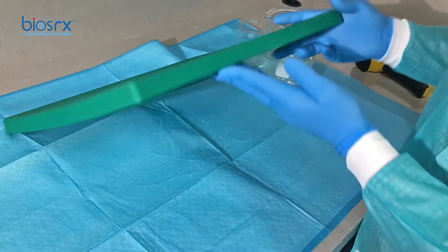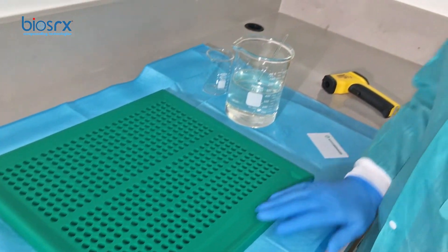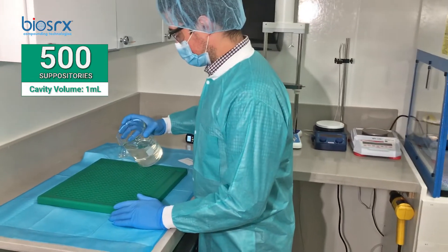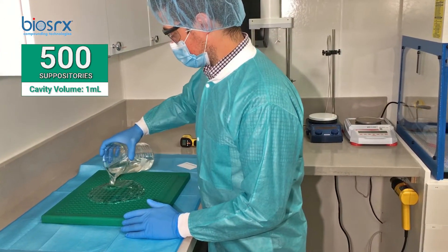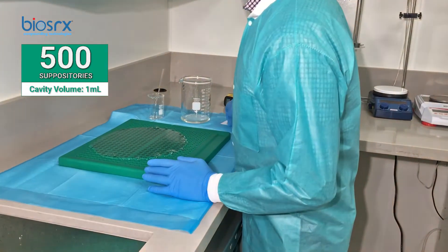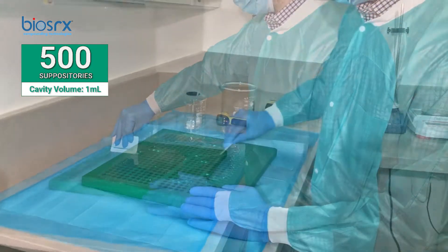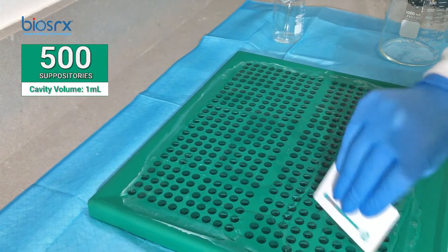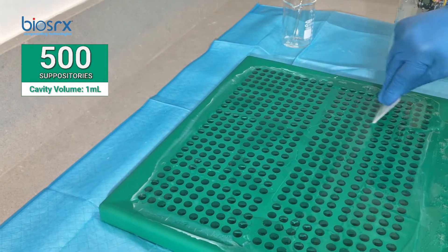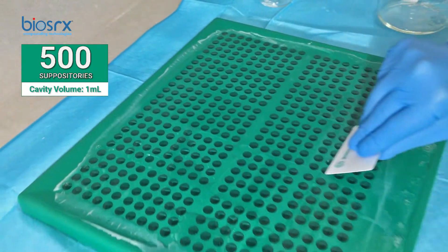This is a high-density silicone mold with 500 cavities and a trough where you can collect the excess — that's the base from PCCA. We want to make sure that every cavity gets filled, and then once every single cavity is filled, we'll start collecting the medication into the trough. It looks like a great job filling every cavity.